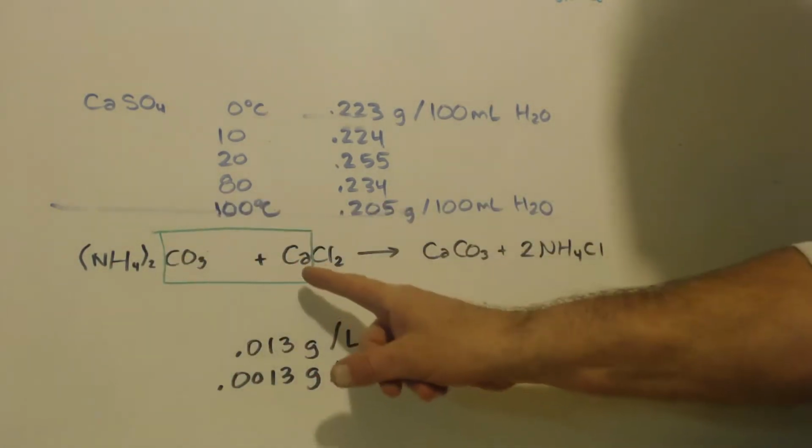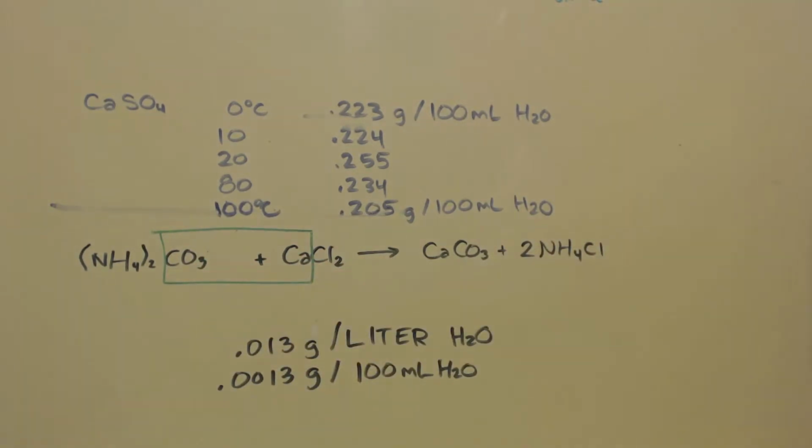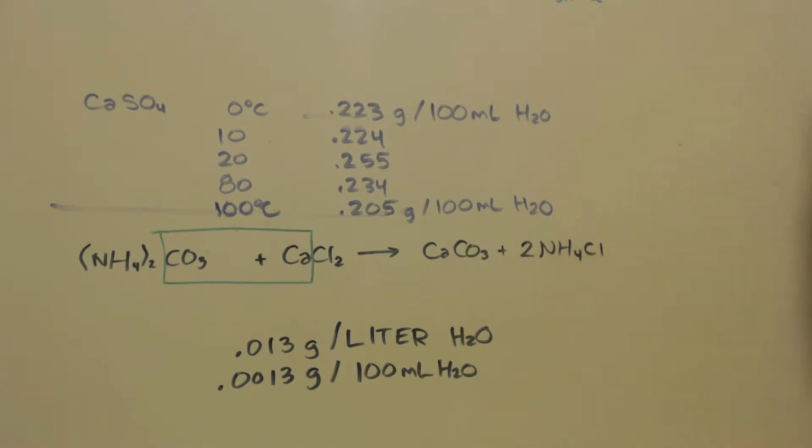but when you put them together, now you'll have ions of calcium and you have ions of carbonate. They will precip out and leave you with your product that you want. See how nice that is? These are just two examples, but there are many examples that you could do like this to make your salts.